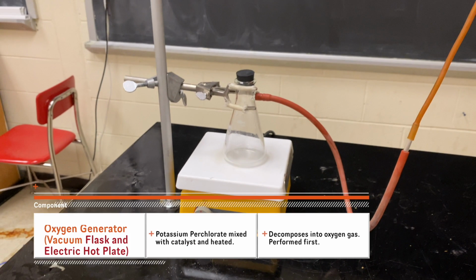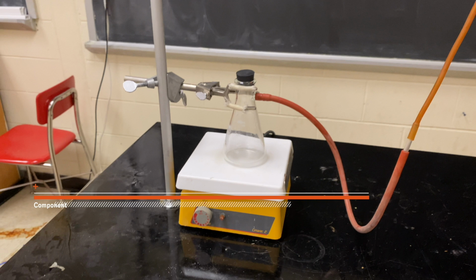This is the oxygen generator. It's composed of a vacuum flask and electric hot plate. Potassium perchlorate is mixed with a catalyst called manganese dioxide. The heat performs a decomposition reaction which rapidly produces oxygen gas. This is the first reaction that's performed since the gas is produced so rapidly.